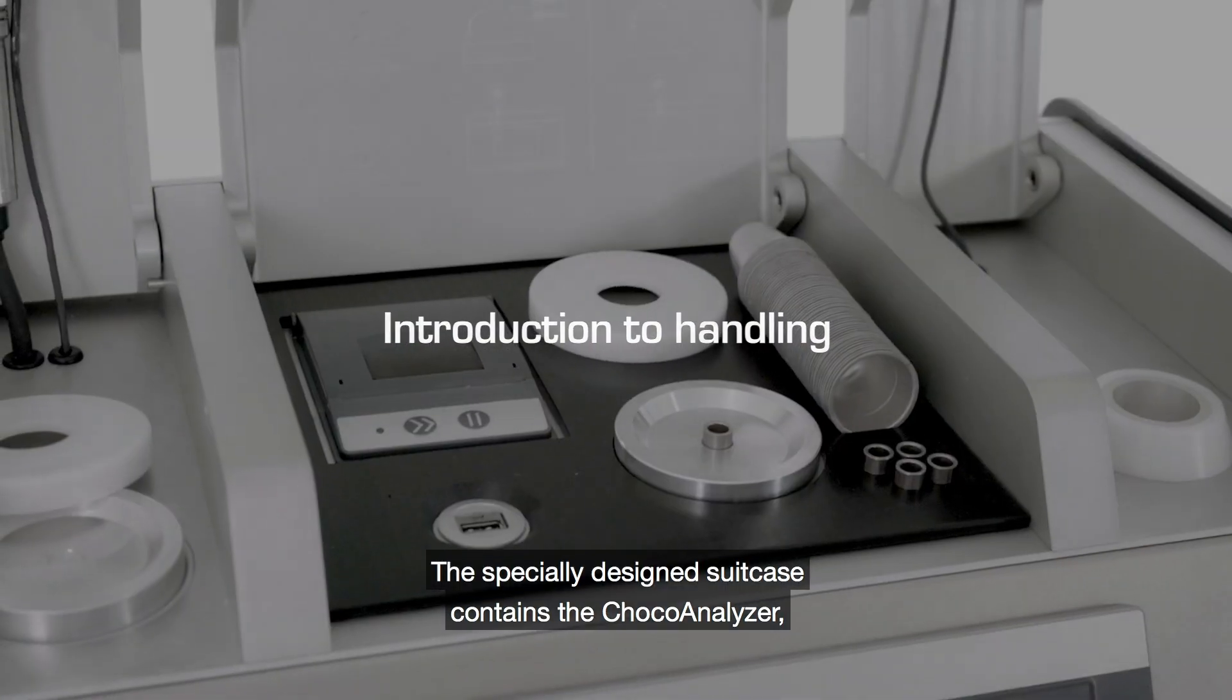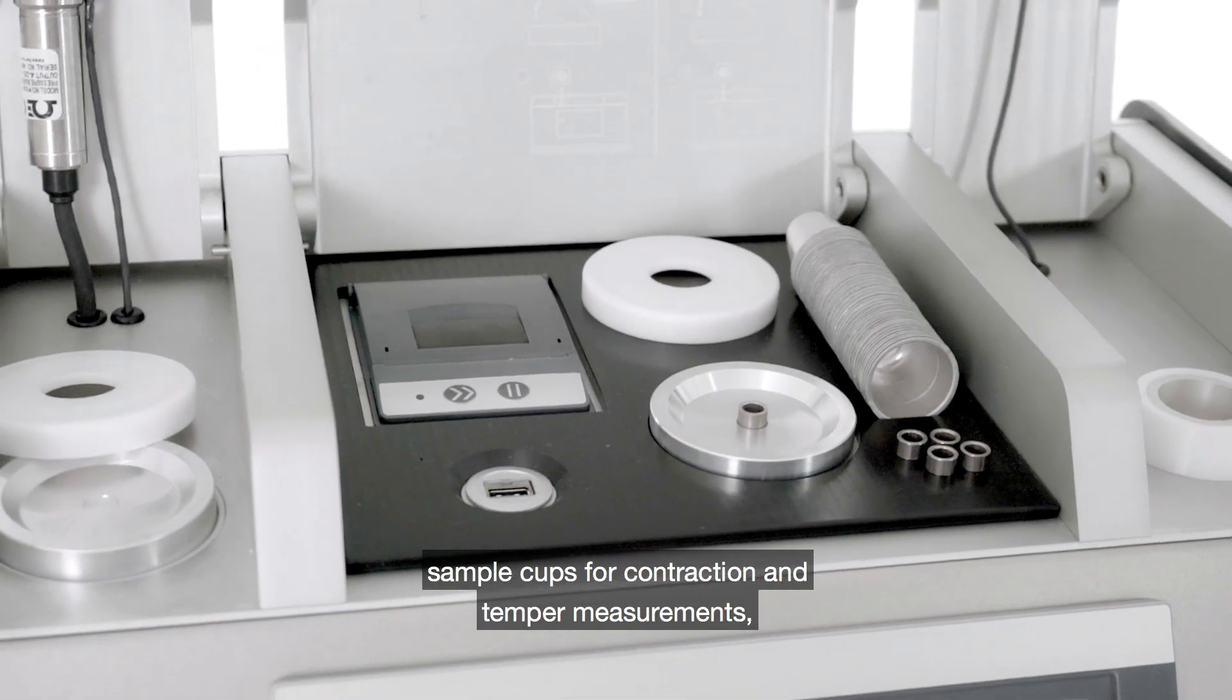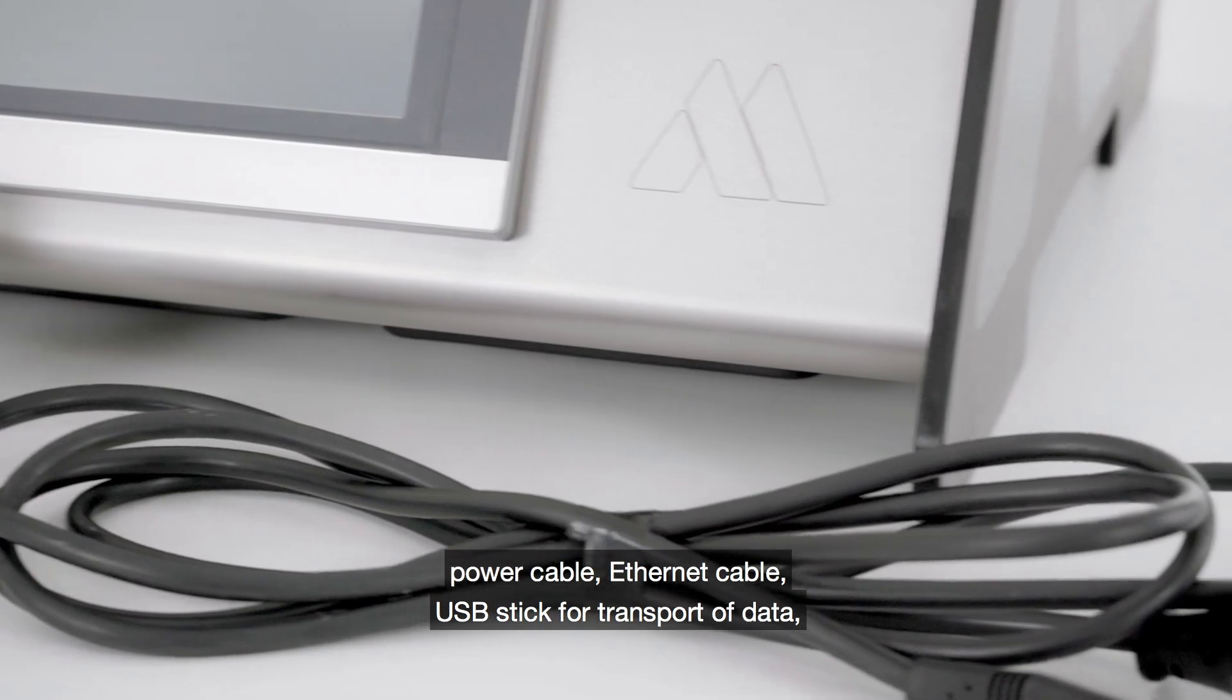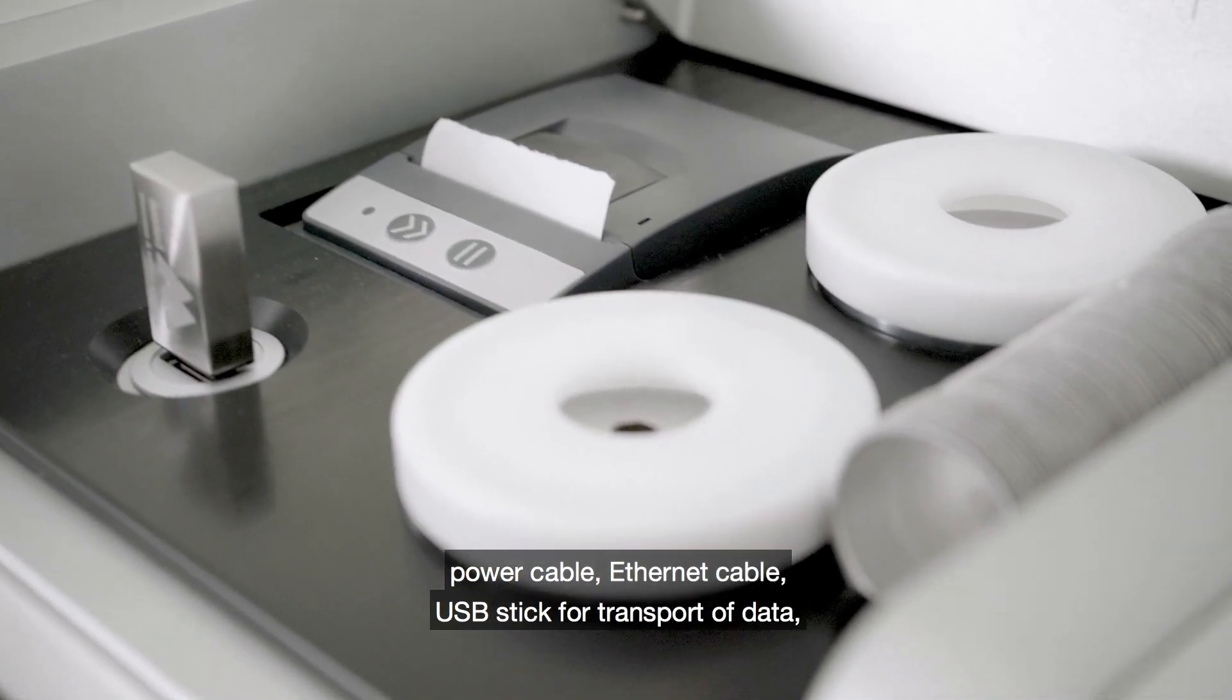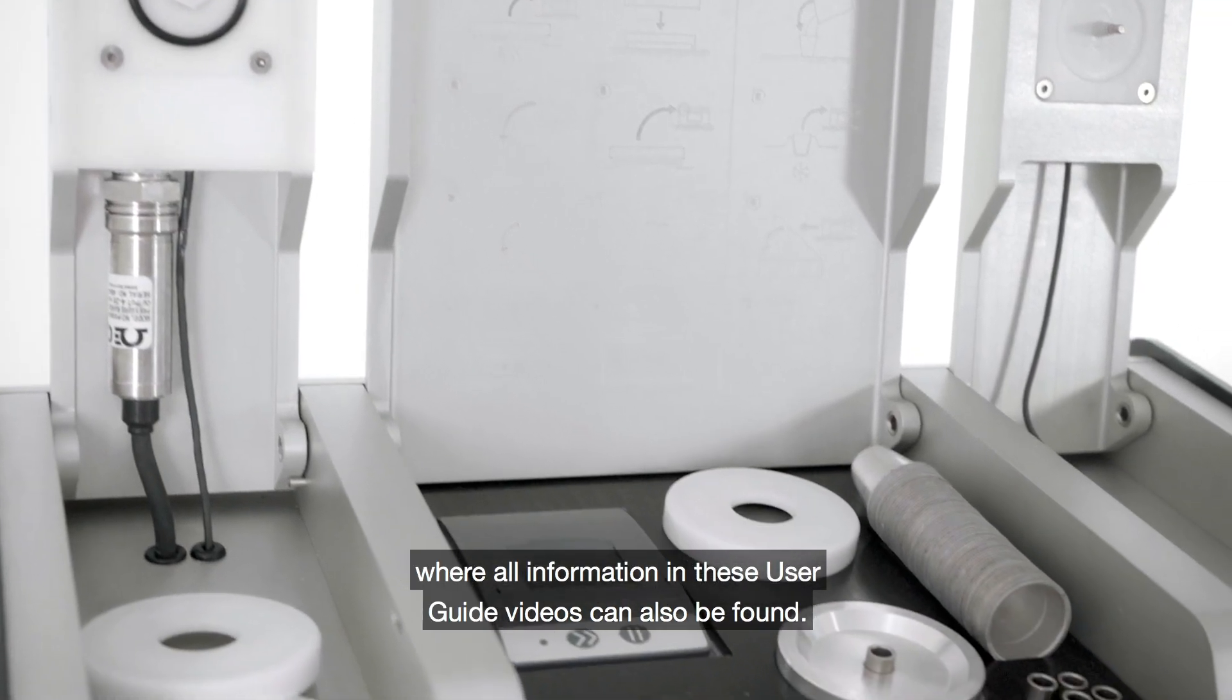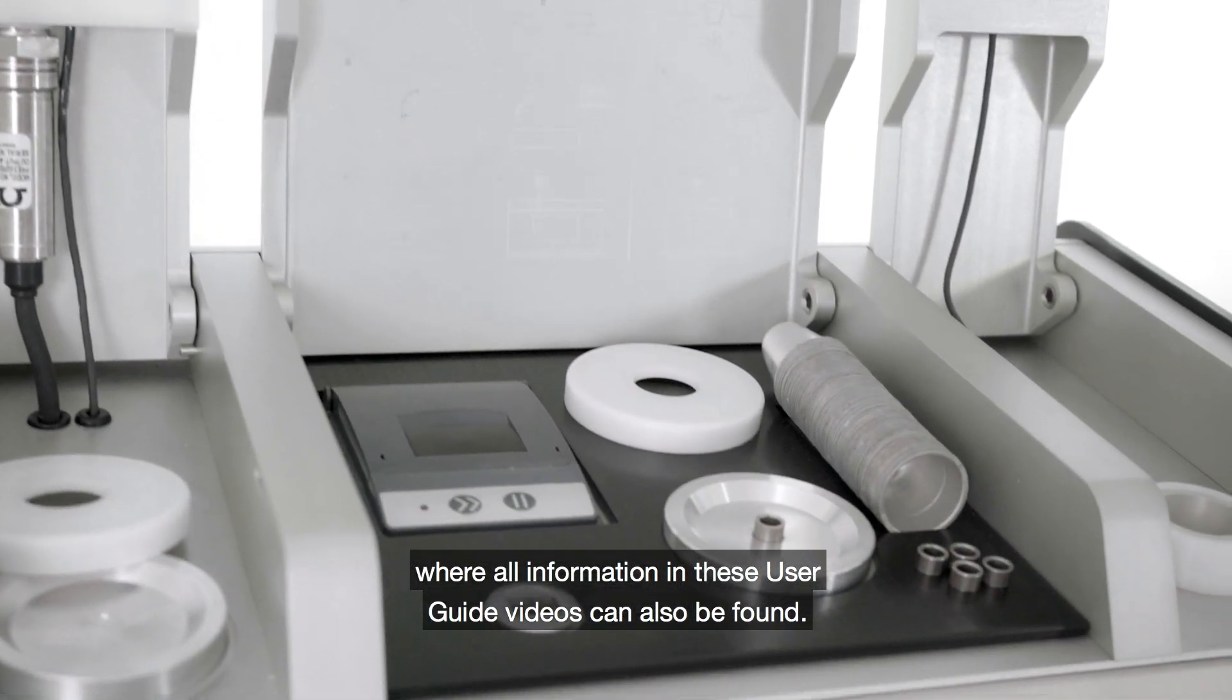The specially designed suitcase contains the ChocoAnalyzer, sample cups for contraction and temper measurements, power cable, Ethernet cable, USB stick for transport of data, and an extra roll of printing paper and a user manual where all information in these user guide videos can also be found.